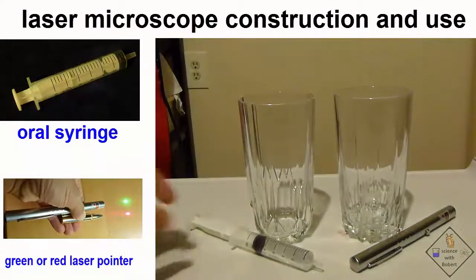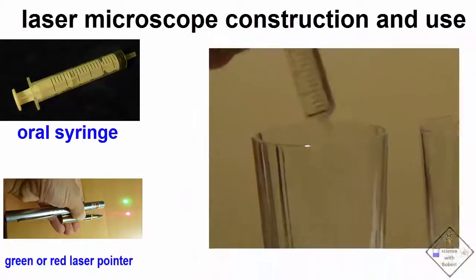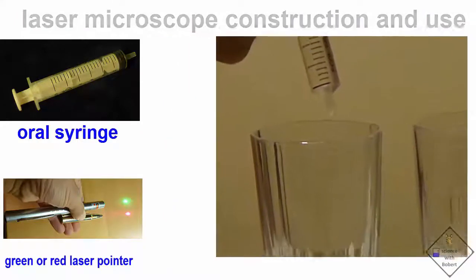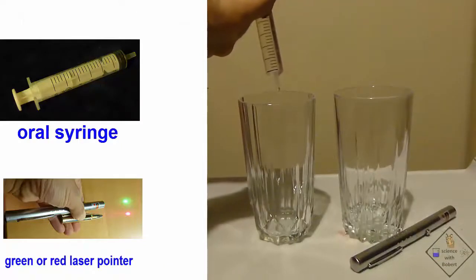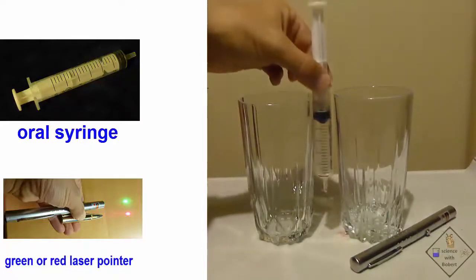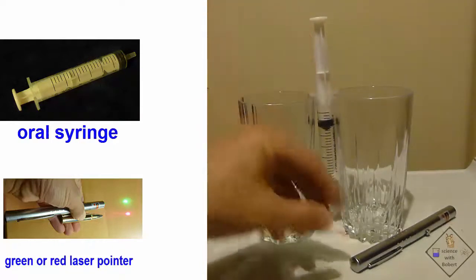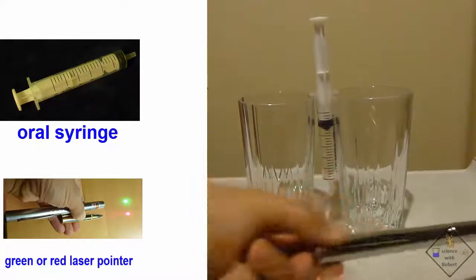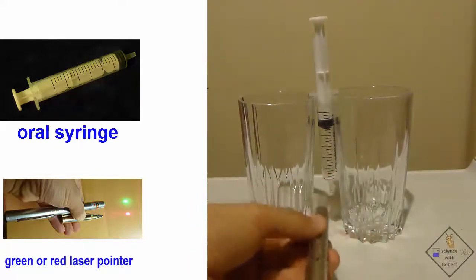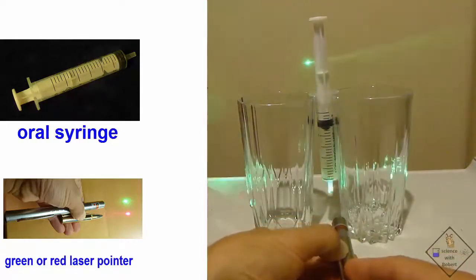To analyze a sample with your laser microscope, just fill the syringe with a sample. Then push down on the syringe plunger until you create a hanging drop. Carefully place the oral syringe with the hanging drop between two glasses that serve as stands. Next, shine the laser pointer through the drop such that the projection falls onto a wall. You can make the projection larger by moving your microscope farther away from the wall.